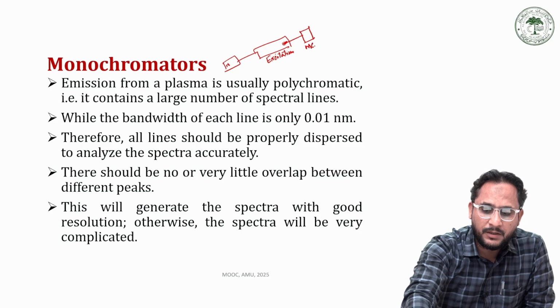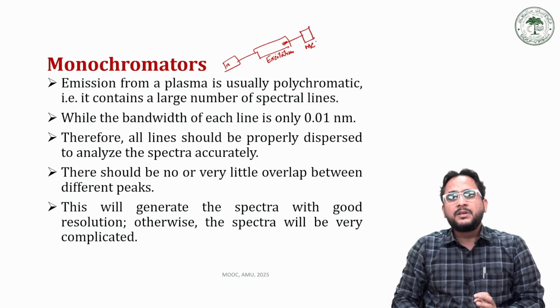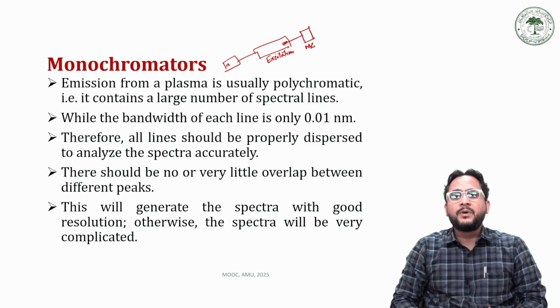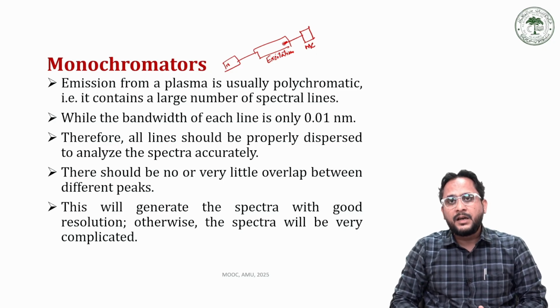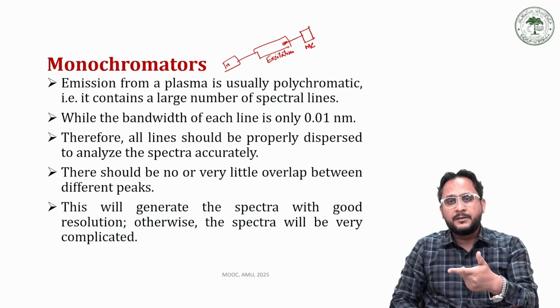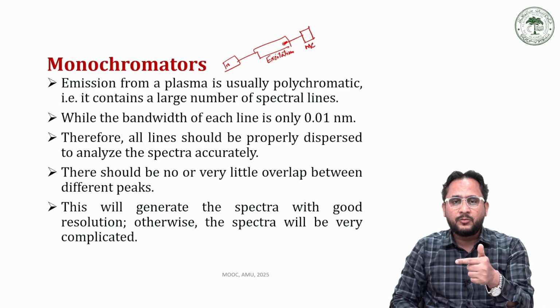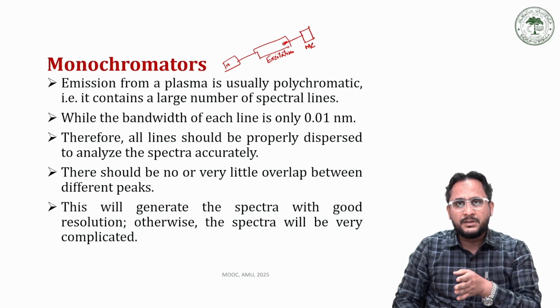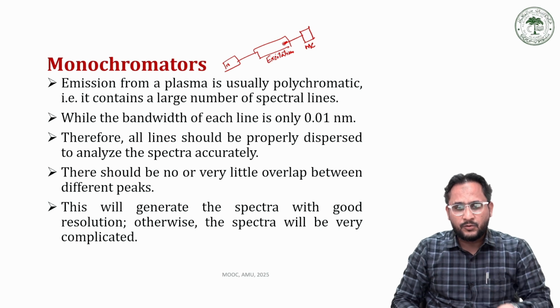This is the monochromator. So always remember, in atomic absorption spectroscopy, we use the monochromator before the atomizer is placed. Just after the light source, we use a monochromator, we select light, and then the selected monochromatic light enters the atomizer for absorption. While in the case of atomic emission spectroscopy, we do not do that. We use the monochromator after the excitation or atomization source.